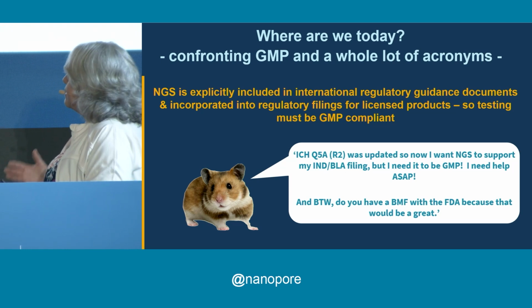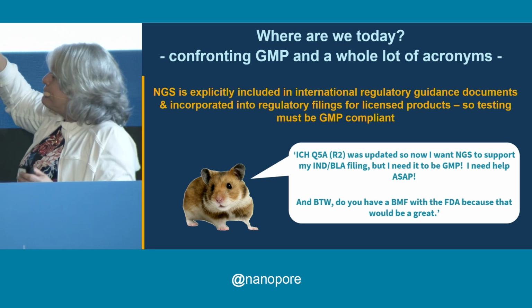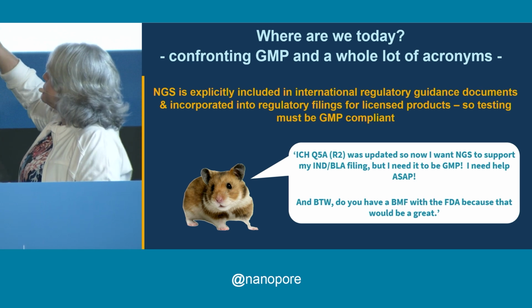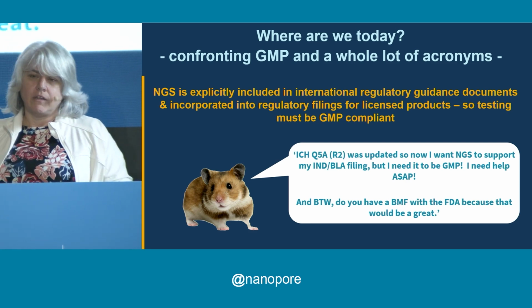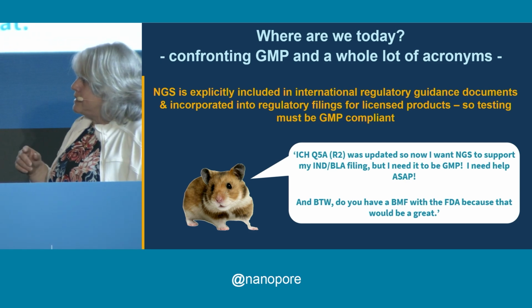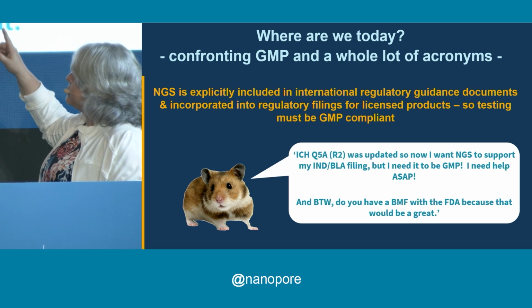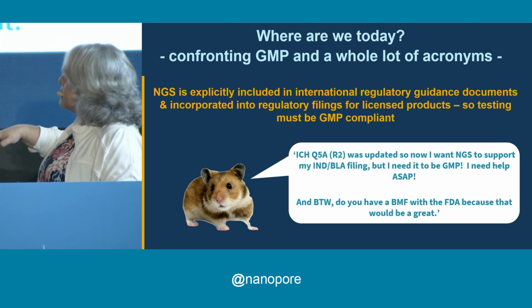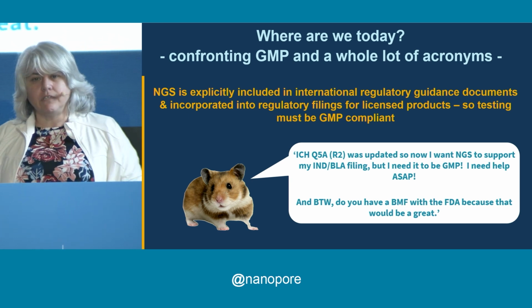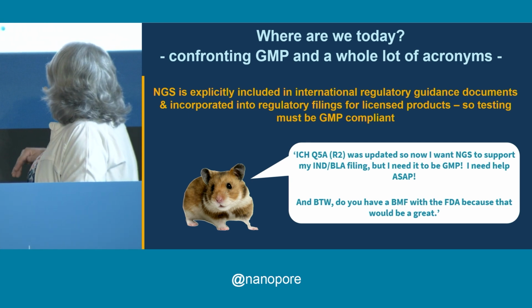Okay, acronyms. You get buried in acronyms. So sequencing in various modalities is explicitly included in these international regulatory filings. And the most recent one to be updated was the ICH Q5A, which is the International Council for Harmonisation, blah, blah, blah. And they have a series of these documents. They just updated it. They have included sequencing now as a very specific testing strategy here.